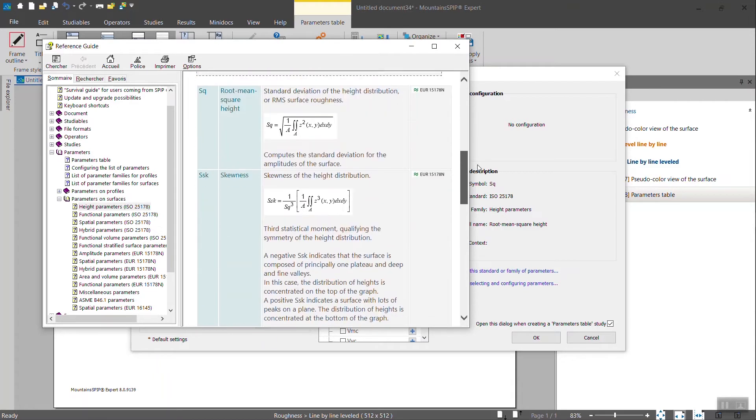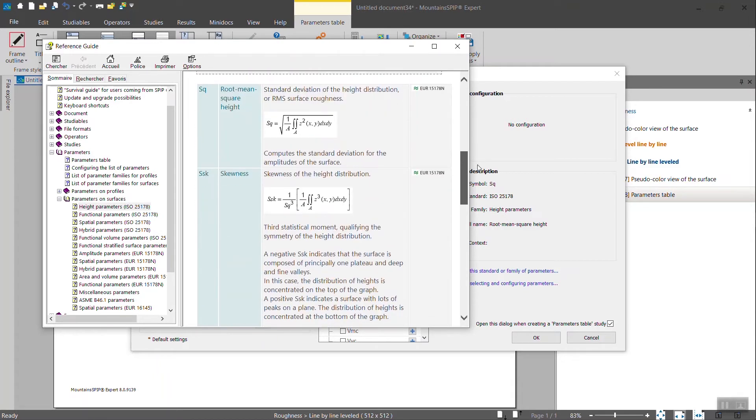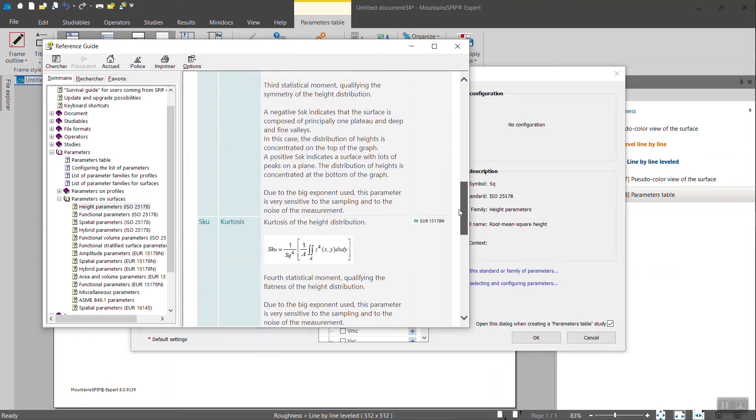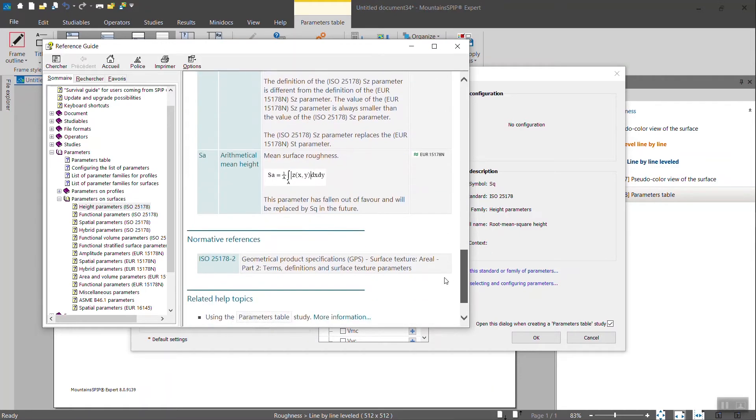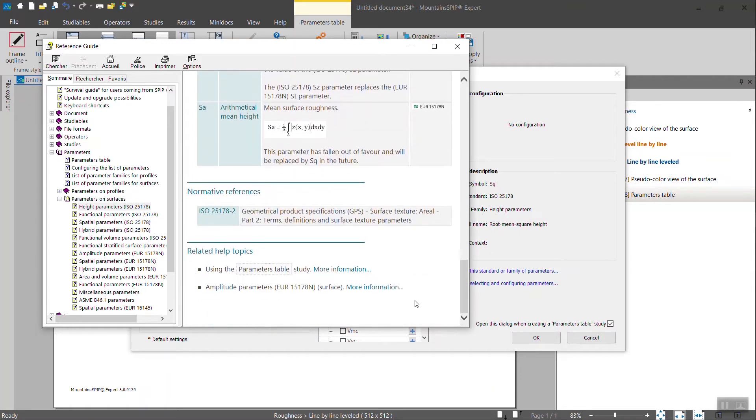Information, definition, calculation, reference to previous standards. And the same for all of the parameters that we provide in Mountains technology.